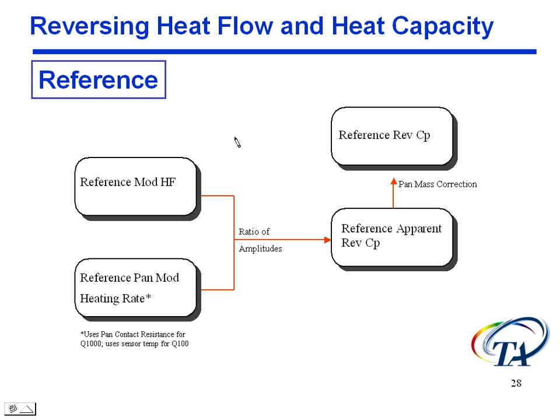Okay? Now, reversing heat flow and heat capacity continued now. Let's look at the reference side. So we do basically the same thing that we saw before.